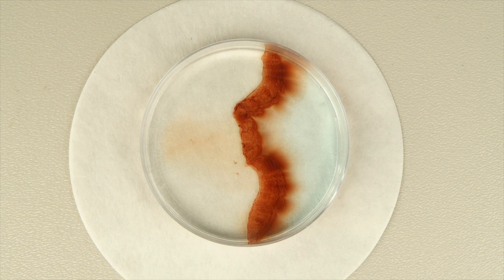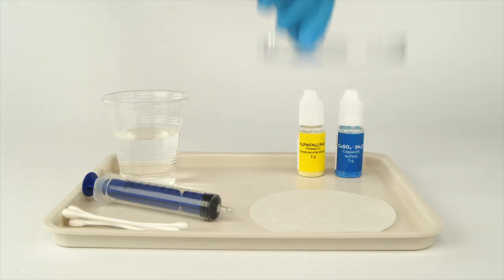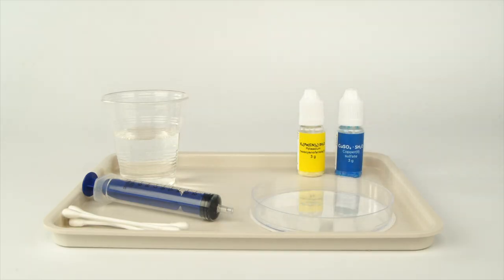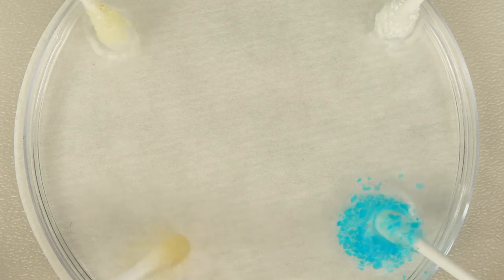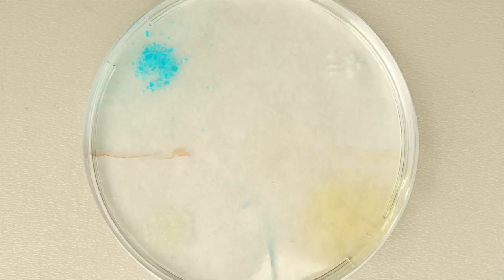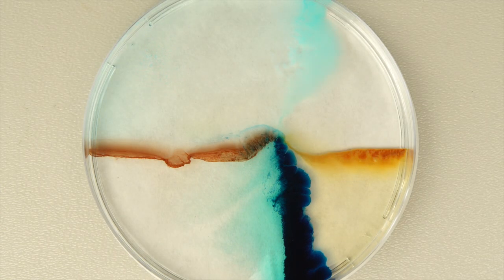Try making four different reefs at once. To do this, you'll need the large petri dish, sodium carbonate and ammonium iron 3 sulfate — iron alum. Experiment with various combinations of the solid reagents to make a wide variety of beautifully colored reefs.